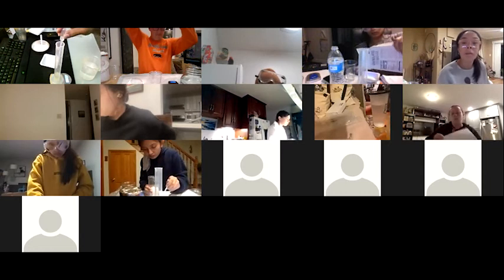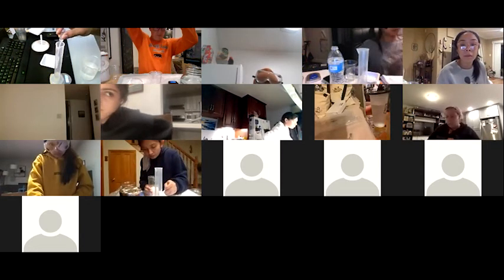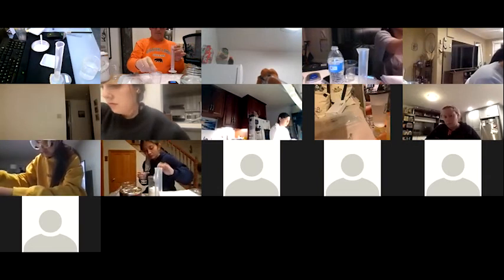Professor, I have a question. For the 10% one, I did all the 50 ml water and then 5.5 grams. And after that, what do I do? Stir it till it's all dissolved. Yeah, it's dissolved, and then what's next?